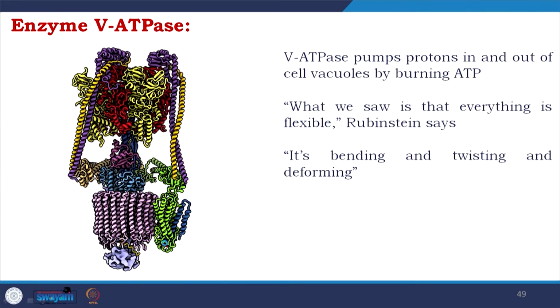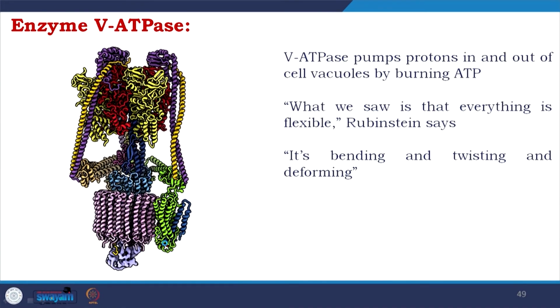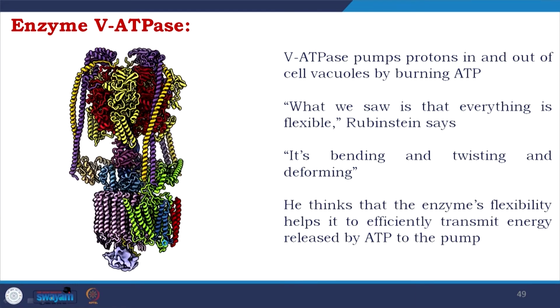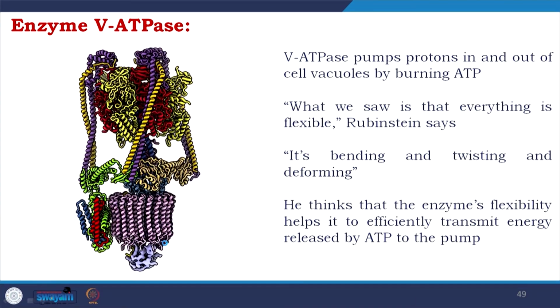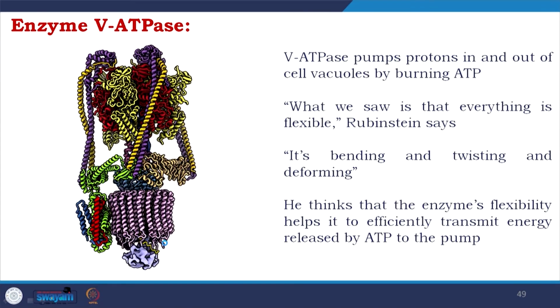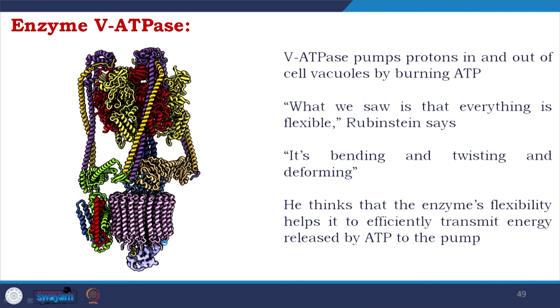It is bending, twisting and deforming. I do not need to show you, you could see the movie presented by them. He thinks that the enzyme's flexibility helps it to efficiently transmit energy released by ATP to the pump. So, now from a high resolution structure, you could also go for determination of understanding of function directly.